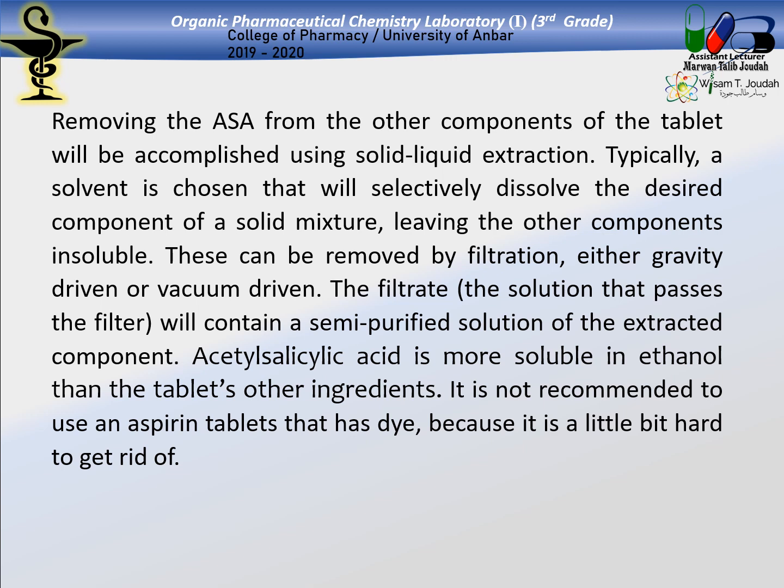And نقول it's not recommended to use aspirin tablets that have dye because it is a little bit hard to get rid of. هنا شنو هو الدايز؟ يقصد بها الالوان. بعض الاسبرين تابلتس تكون الوانها شلون؟ انا شايف لون وردي، اوكي، البينك تابلت. هذا البينك تابلت كلش مزعجه بالشغل، يعني ممكن ما تعطينا الشيء اللي نريده، ممكن هاي الالوان تاثر على عمليه الاكستراكشن، فبالتالي ما راح نحصل على الديزاير برودكت. ف it should be a white tablet.